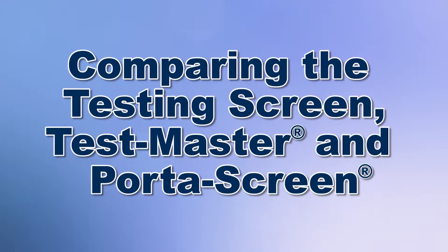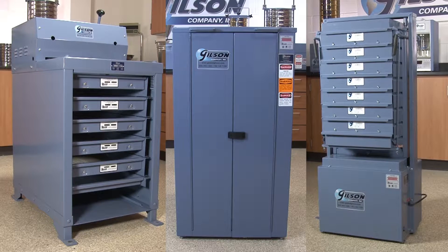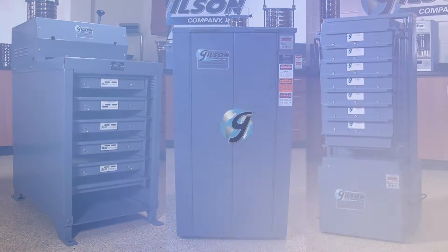When your lab needs accurate and reliable particle size determinations, then Gilson is your best choice.